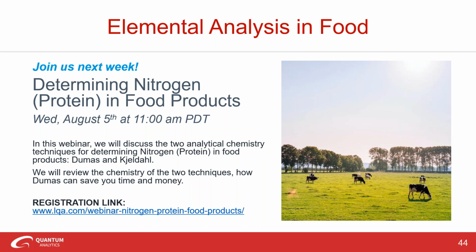Yeah, actually, heavy metals is something that's quite easy and doable by XRF. So it certainly can measure those limits of detection. And of course, there are some caveats here. You need to make sure that you've taken care in preparing your sample and making sure that it's dense enough to analyze, and what type of material it actually is. But yes, that is definitely one that is doable by energy dispersive XRF.